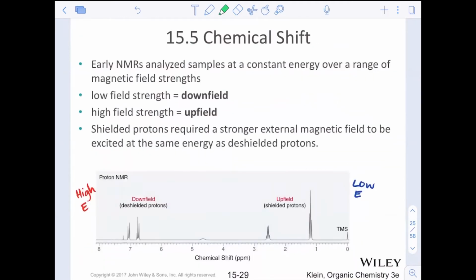Now, those chemical shifts are constant. There will be a table on our worksheet when we get to class that looks at all of those chemical shifts based off of predicted environments, different protons attached to carbons, nitrogens, oxygens, etc. What we want to be able to decipher, just like in IR, is what makes things shift to a greater ppm and what makes the protons appear at a lower ppm.